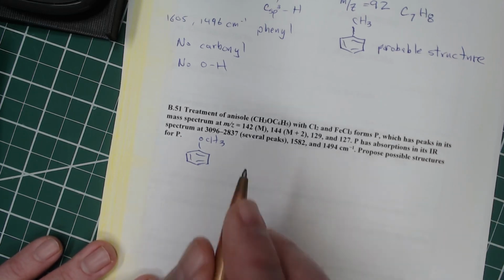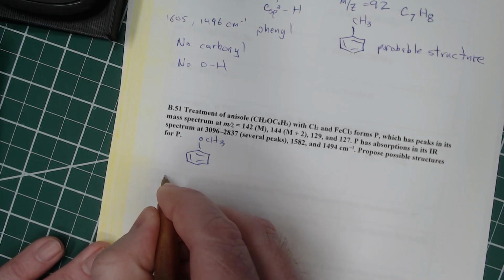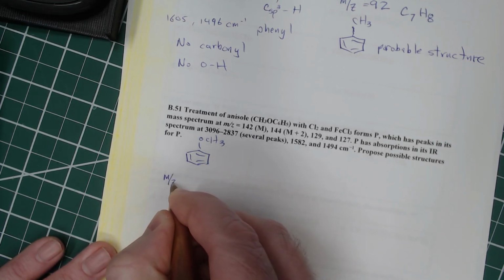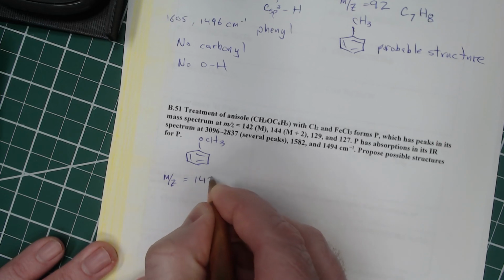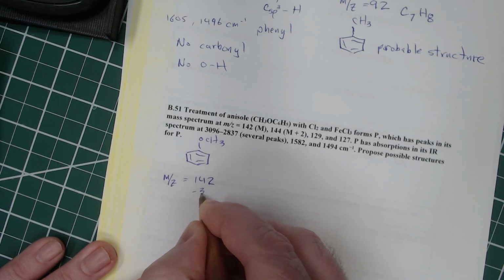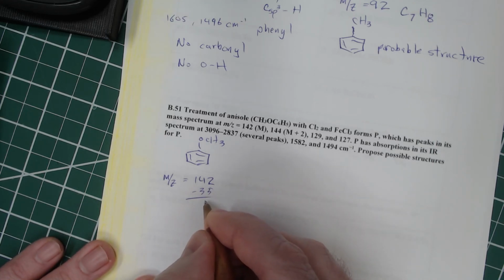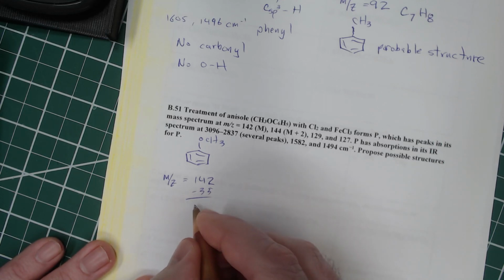All right, so let's figure out what that molecule could be. So we'll do our M over Z. It's equal to 142. And let's subtract 35 from that. And when we subtract the 35 from that, we're going to get, let's see, 107.